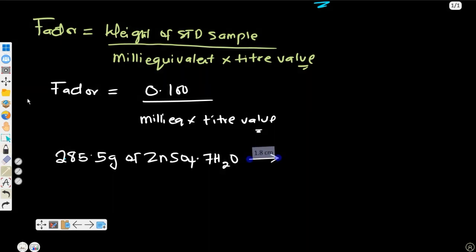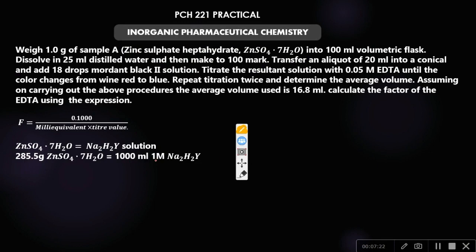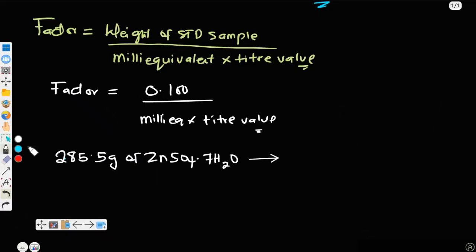They already gave you the relationship. It is present in 1000 ml of 1 molar sodium edetate.